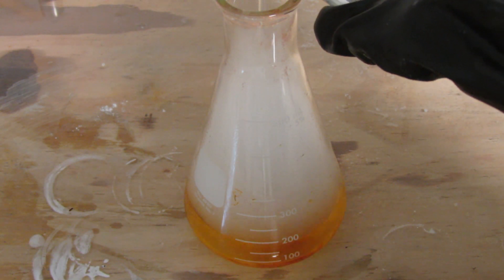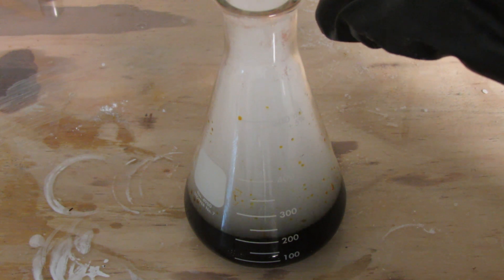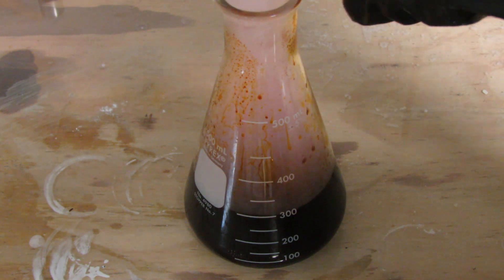Now for the fun part. Add 30ml of 3% hydrogen peroxide for each 1 fluid ounce of tincture of iodine. This precipitates out the iodine, which is a deep purple black color.